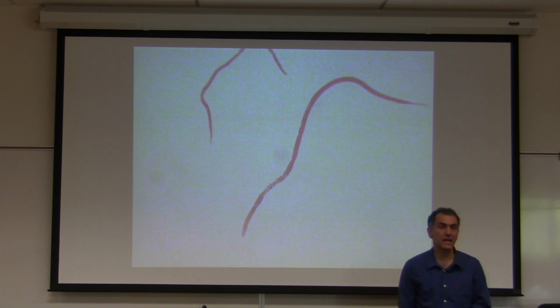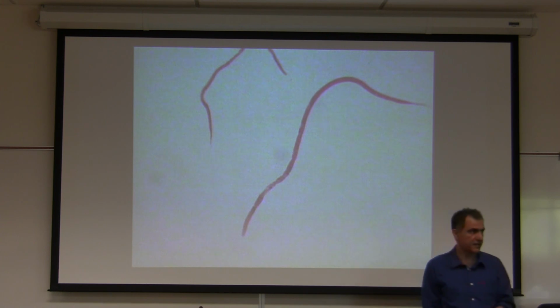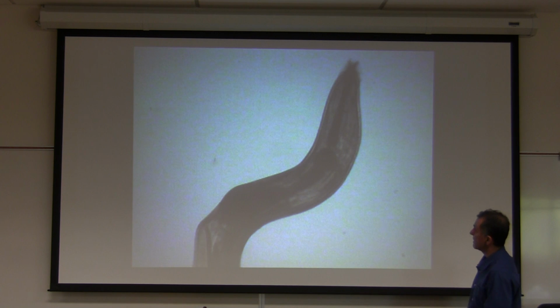Anguillula aceti. And what is the common name? Vinegar eel. Is this parasitic? No, it's free living. We consider it a free living organism.